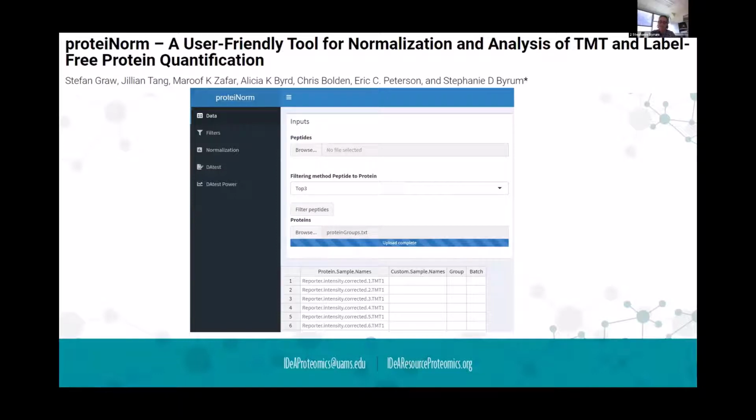Normally, for most experiments, we can start with a protein group file, do all our analysis, and have good data at the end, finding some nice differentially expressed proteins that make biological sense. You can validate them, write a paper, and you've got something to go with. Sometimes there are certain proteins that are really biologically interesting, and if they're lower abundance, one bad peptide identification can skew the protein group intensities. So for some of those, we have to investigate a little deeper at the peptide level in order to do some corrections of the identifications.